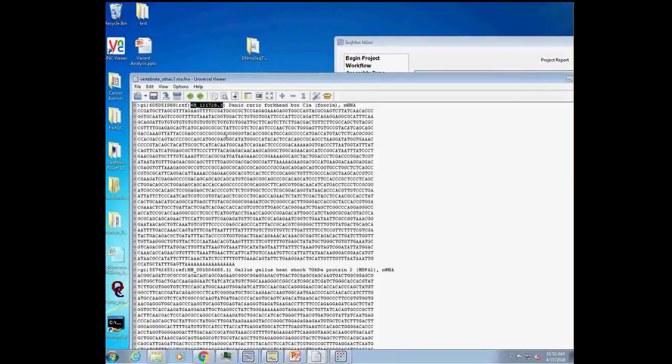However, in order to extract the human-readable text in the appropriate fields, there's a computer language that we use to extract out the pieces. It's called grep. So if you're using a FASTA file from another source, we can help you change the grep so that it extracts the right bits of information. What we can't do at this time, though, is combine different databases in one de novo assembly.